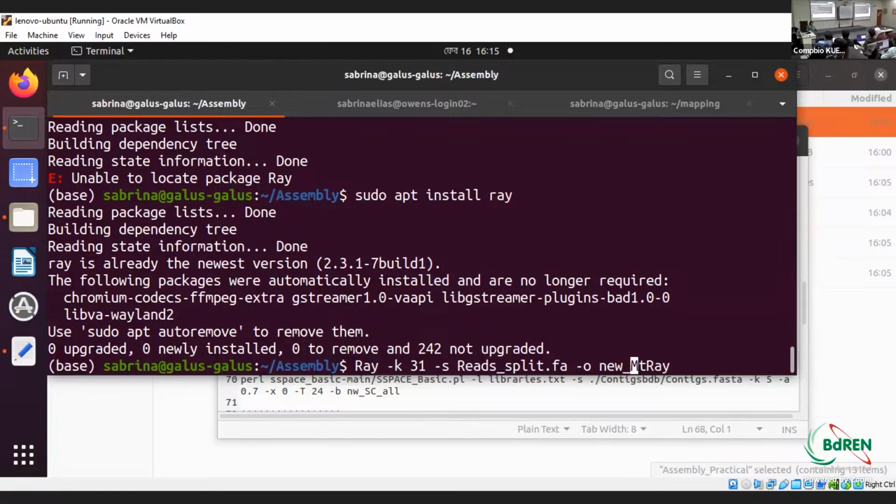So for now, I have provided it in the assembly folder, right? And from real life problems, you will get this from the genome sequencer, the FASTQ files you will get. You can convert it to FASTA, or you can use the FASTQ also. So we need to assemble those files, right?